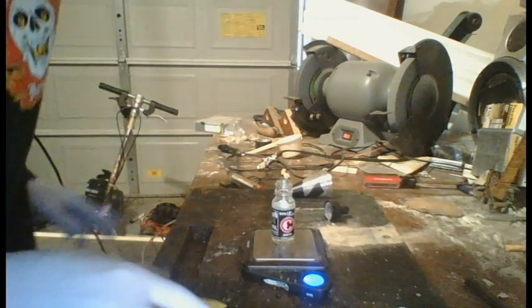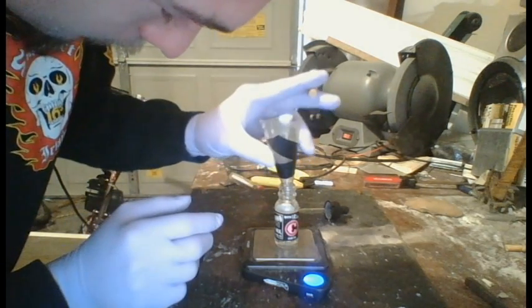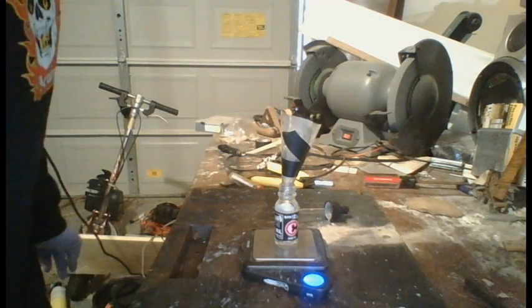We are at precisely two grams. Now I will take this funnel here — this is just regular store brand muriatic acid from Walmart. They sell it for cleaning concrete and brick.